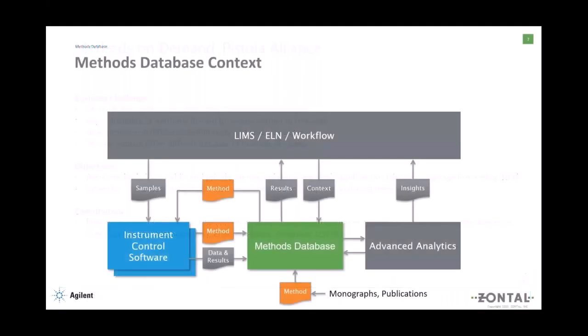So if we put these two workflows using a digital method and creating a digital method into a wider context, we will have the instrument control software that is consuming digital methods or using the editing capabilities, also producing digital method. So this is a part that we will present live today. And then the second input part would be this new project that I just mentioned, where we will parse out methods from monographs and publications.